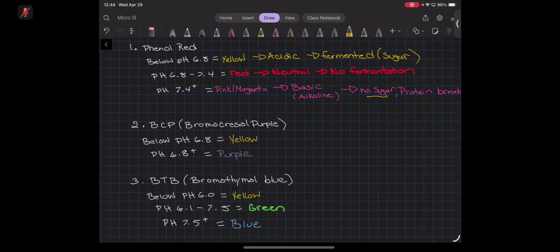I don't recall ever not having a red. So the broth could be any color. It could be yellow, red, or pink if it's the phenol red. That's just the one we saw. It's not good. That's why I'm kind of confused. I know, but the red and the pink might be the written questions.